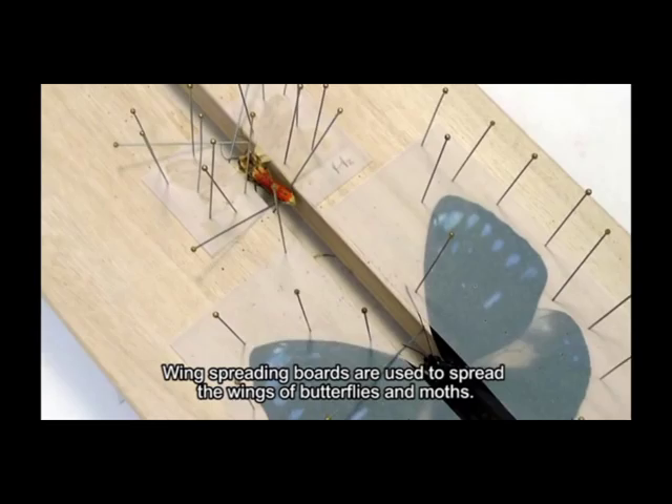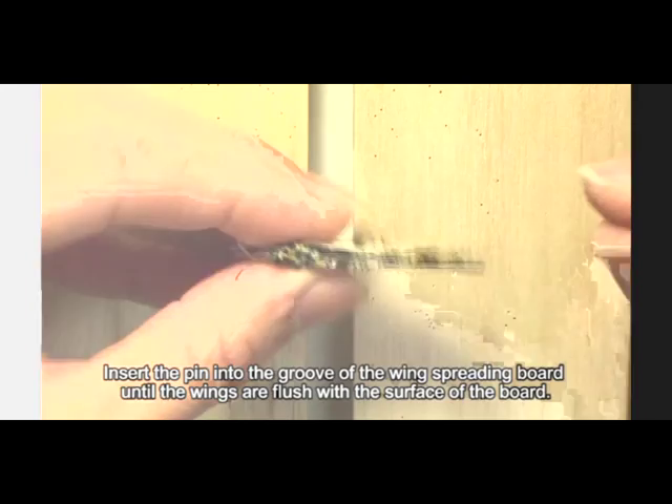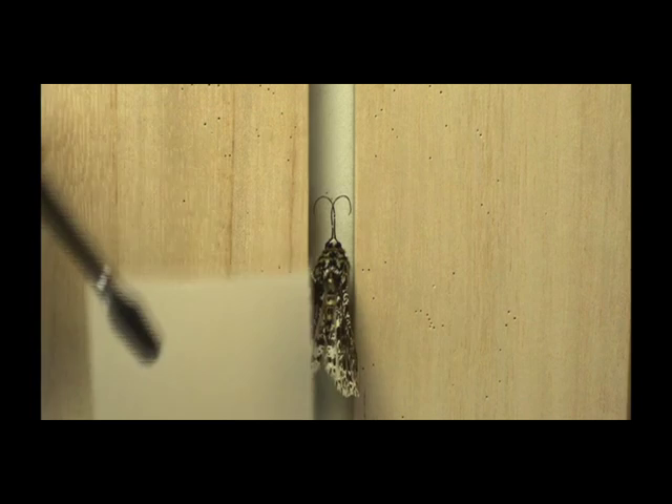Wing spreading boards are used to spread the wings of butterflies and moths. First, hold the thorax of the insect with your thumb and index finger, then use the other hand to pin the insect like any other pinned insect. Insert the pin into the groove of the wing spreading board until the wings are flush with the surface of the board.